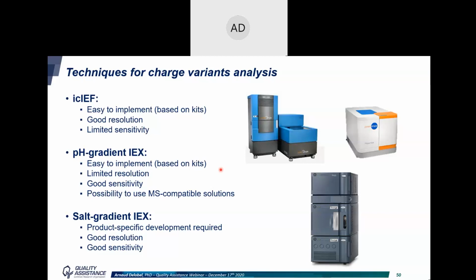You can also use pH gradient IEX. It's easy to implement. Once again, it's based on kits. It can be a platform method. You have a limited resolution that can be slightly improved if you optimize your method for your specific product, but you have a very good sensitivity, and you now have the possibility to use MS-compatible commercial solutions. And finally, salt gradient ion exchange chromatography. You will have to do a product-specific method development, but then you will obtain a very good resolution and a very good sensitivity. So most of the time, we use our H-Class Bio systems to perform this kind of separation, either for pH gradient or salt gradient.